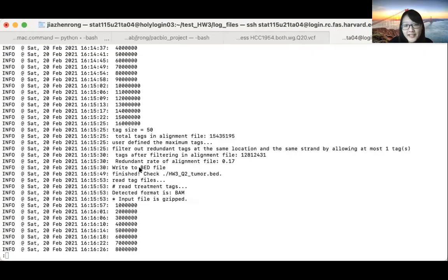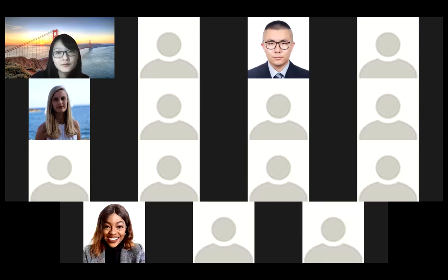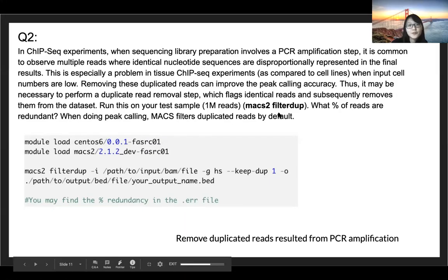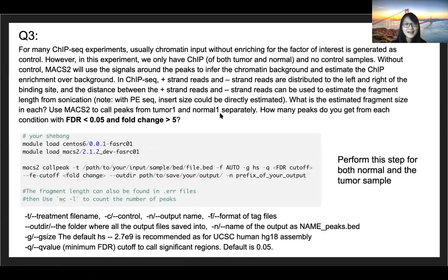We also ask what's the percentage of reads that are redundant. You can actually find that in your .err file. There will be a lot of lines printed. Let me show you guys in the terminal. There will be a line saying 'redundant rate of alignment file: 0.17', so that's the percentage of redundant reads in your BAM file. Even though I know this question is only for graduate students, for undergrads, in order to do Q3 and Q4, you also need to do Q2 as well.